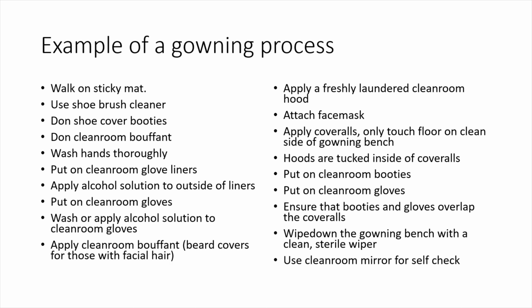There's the importance of either changing shoes or donning shoe covers. It's very important to have washed hands or to use an alcohol solution. Some people use cleanroom glove liners and apply alcohol solutions to the outside of the liners. It's important to put on cleanroom gloves in an aseptic fashion. It's important then to apply appropriate hand sanitizer to those gloves.